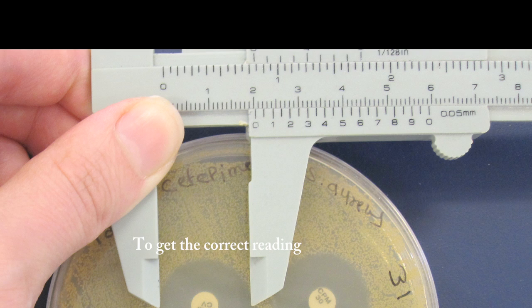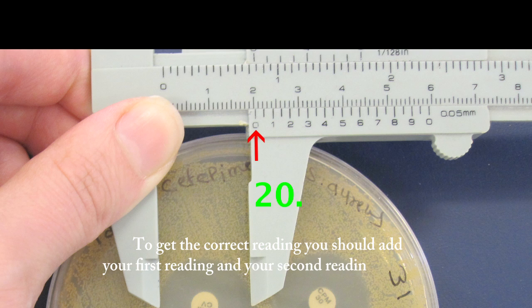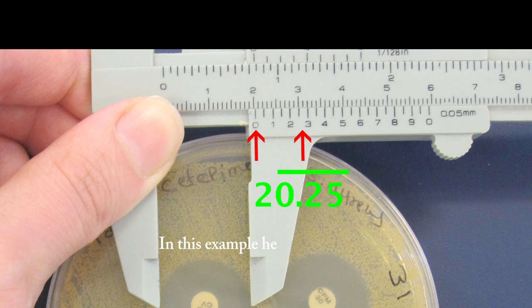To get the correct reading, you should add your first reading and your second reading together. In this example here, the reading will be 20.25mm.